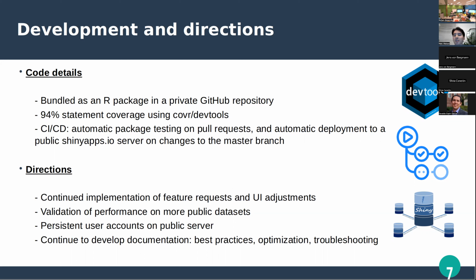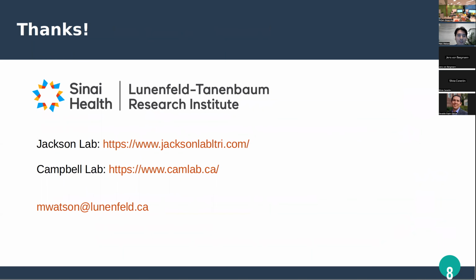And lastly, and I think this has been mentioned by a few people here today, documentation is extremely important to our group. We're continuing to optimize the documentation based on our experience with the app as well as other users. Things like best practices, the best way to optimize a given data set, as well as troubleshooting, because biological data can be notoriously noisy and difficult to interpret. We want to make sure that for any troubleshooting users encounter, there will be appropriate guidelines for how to deal with it. So I'll leave it there. That's all I wanted to give as a little preview of our app.